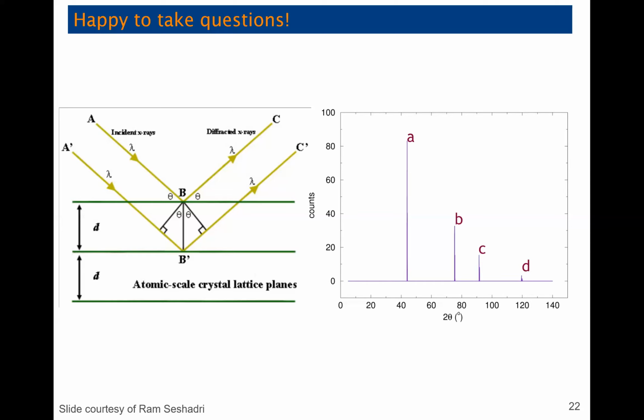That's a great question. So I've definitely seen people do this with a pellet using the same instrument. All we really need for this to work is that we have different particles in the material that are oriented differently, and it doesn't matter if it's loose or pressed into a pellet. One thing the pellet could do is add preferred orientation. If there's any irregularity or non-spherical shape to your particles, by pressing it, you might make them all align more. So you'd have to be more aware that preferred orientation might be affecting your sample results.